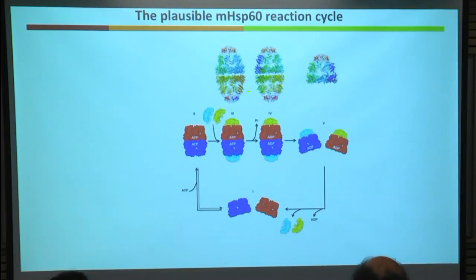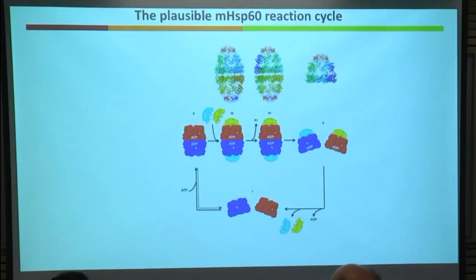We set up hundreds of crystallization trials with the stable version of HSP60 and the helper of the HSP60, the HSP10, with ATP and beryllium fluoride. The purpose of beryllium fluoride is to stack the complex in the prehydrolysis state. We got, in one of the conditions, tiny crystals. After rounds of optimization, we extended the resolution to 6 angstrom.